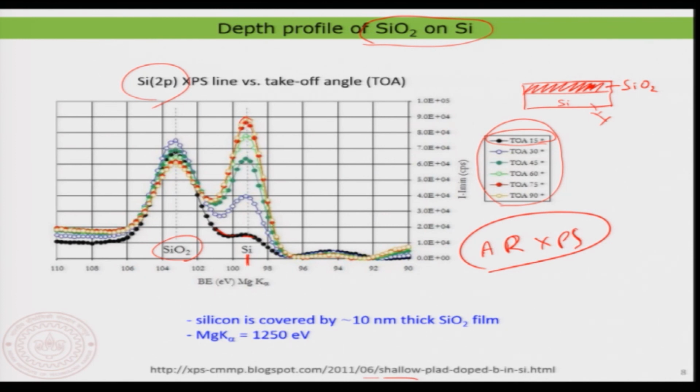I will show you a couple more examples, and I will also familiarize you with a few more interesting new materials that are forming on surfaces. There we will use XPS as a tool in understanding the chemical nature of those materials that we form.